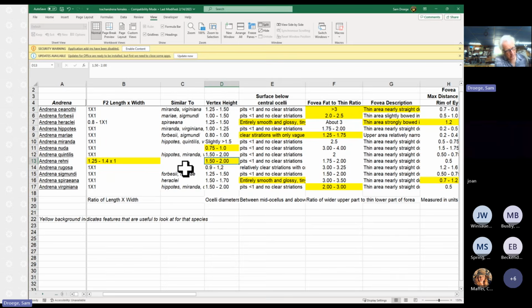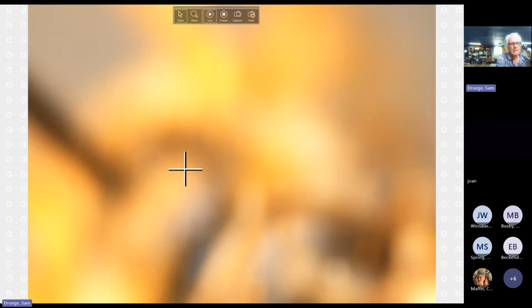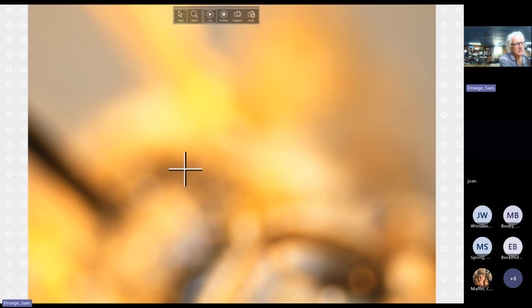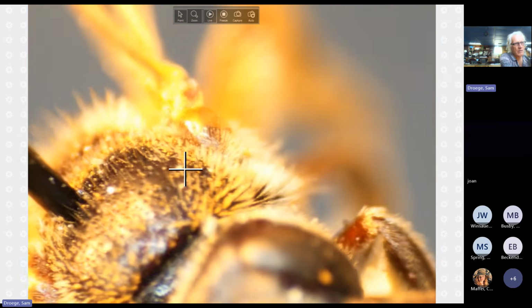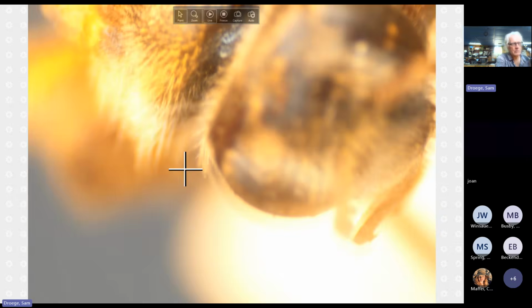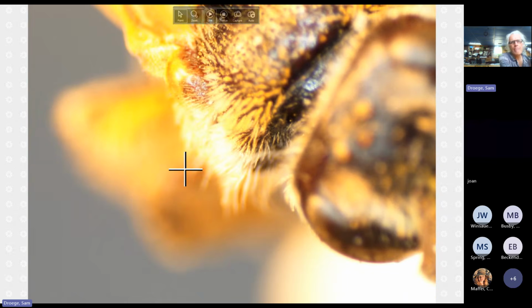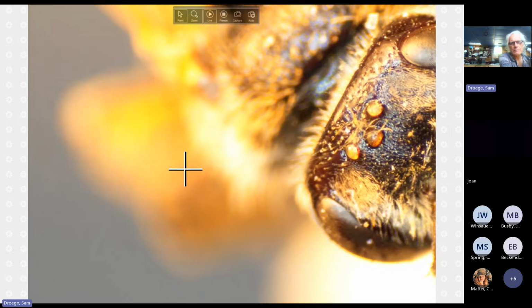Interestingly, it is a question mark how important Chinese chestnuts are, whether they're planted regularly. No one looks at them very much. They do appear to have specimens. Tracy Zerillo has found them on just a random Chinese chestnut. And let's see, what we're looking at is the vertex now. Yeah, I started doing two things at once. But it would be good to do more sampling on Chinese chestnuts.